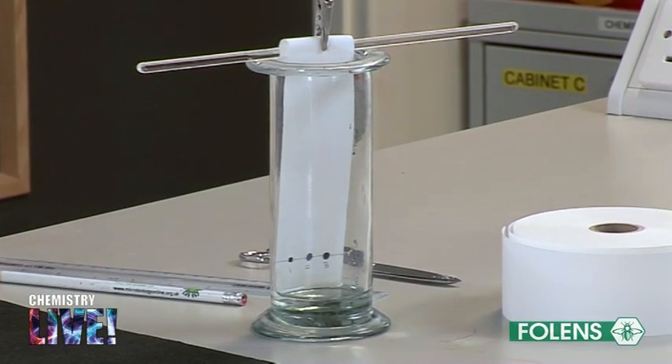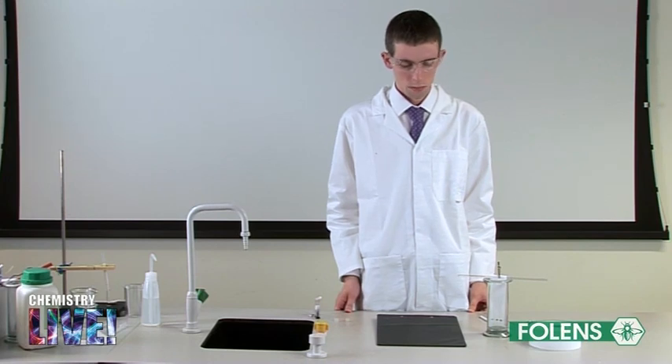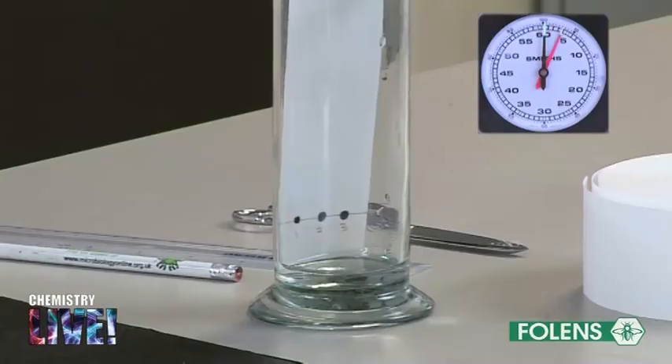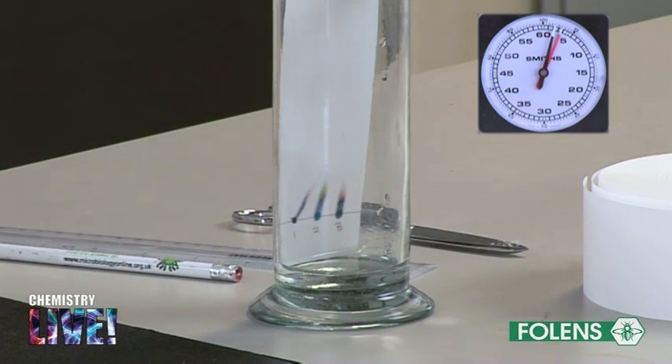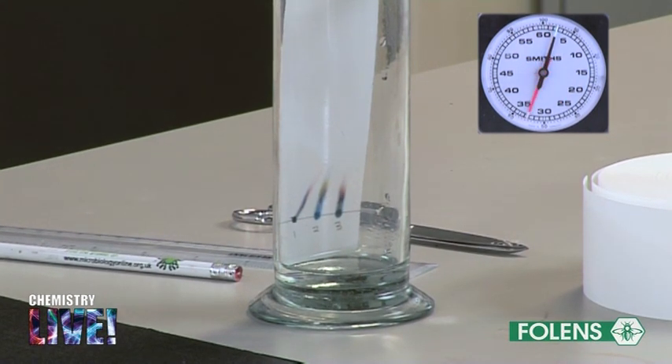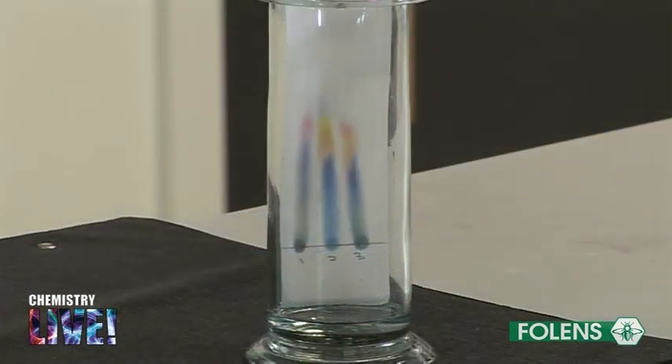Allow time for the solvent to rise through the paper until a good separation of colours is observed. This completes the experiment.